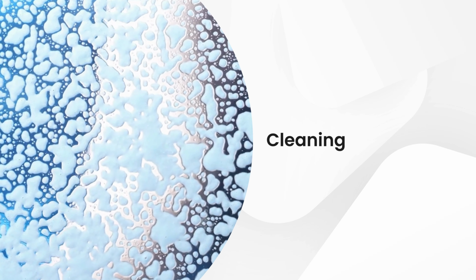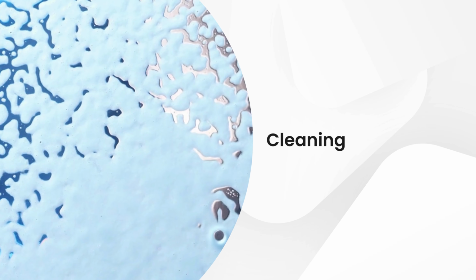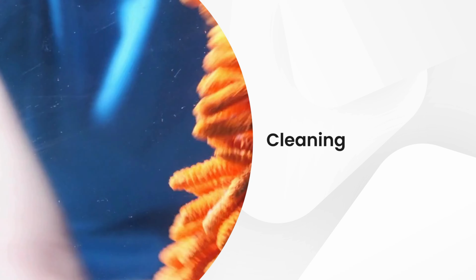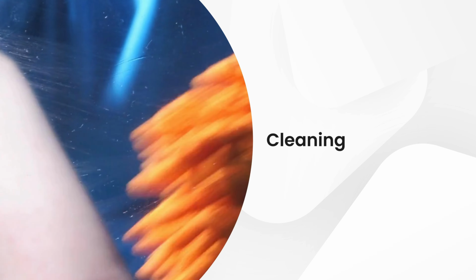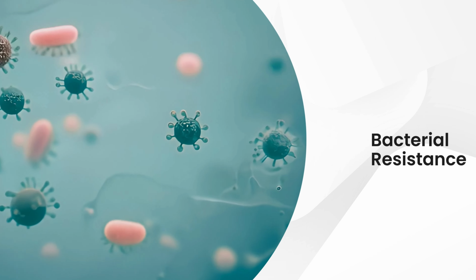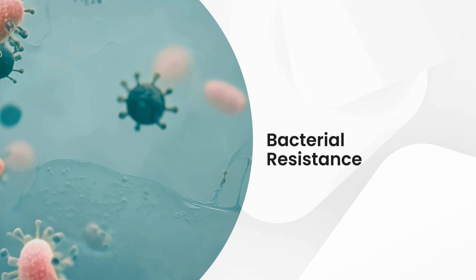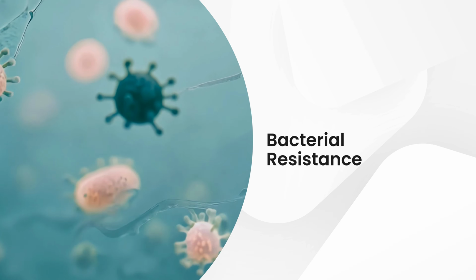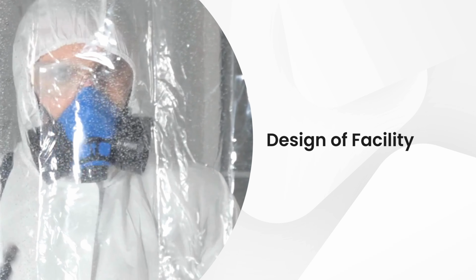4. Cleaning and disinfection practices. Insufficient cleaning frequency. Infrequent cleaning allows bacteria to accumulate on surfaces. Inadequate cleaning procedures. Using incorrect cleaning agents, methods, or equipment can result in ineffective removal of bacteria. Improper disinfection. Failure to use appropriate disinfectants or applying them incorrectly may not effectively kill bacteria. Resistance to disinfectants. Some bacteria can develop resistance to certain disinfectants, making them harder to eradicate. Poor cleaning of hard-to-reach areas. Overlooking corners, crevices, and under equipment during cleaning can leave behind bacterial contamination.